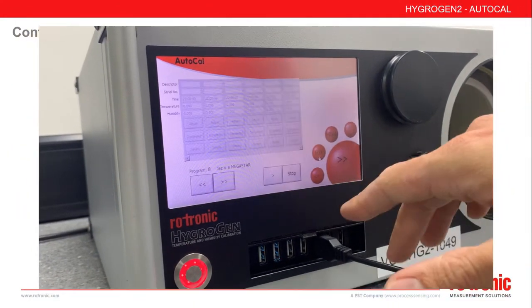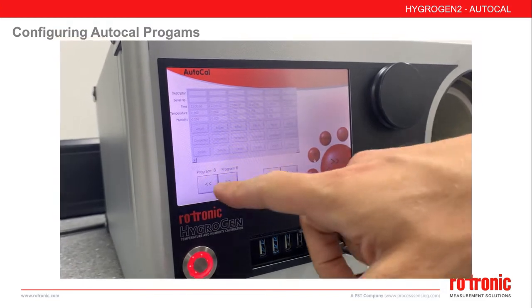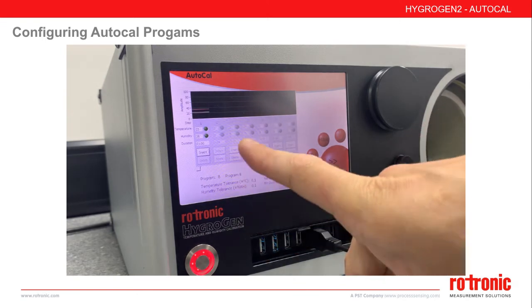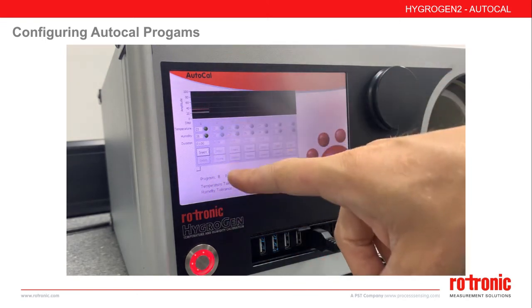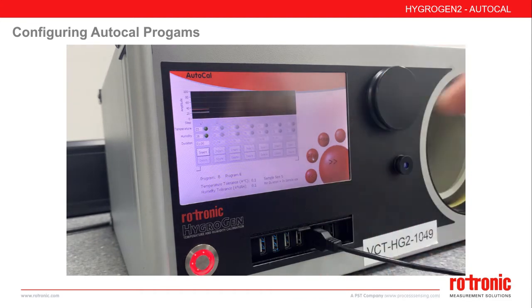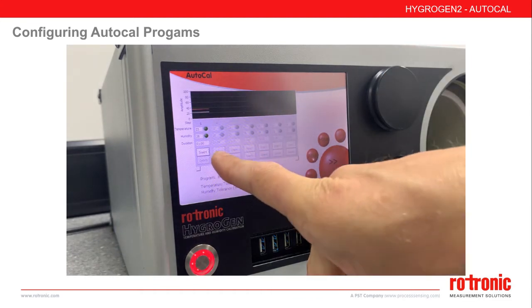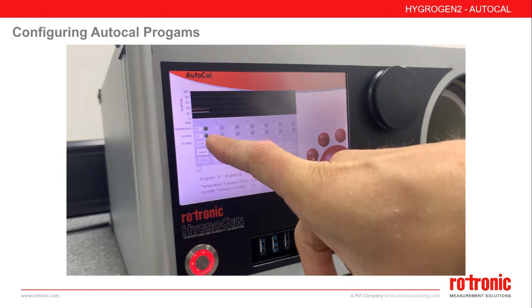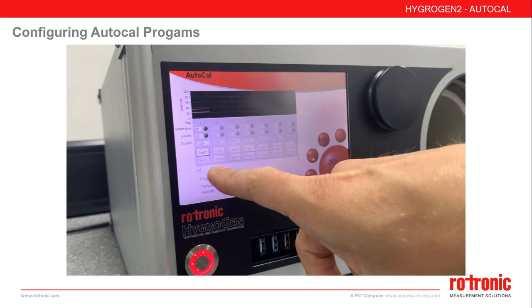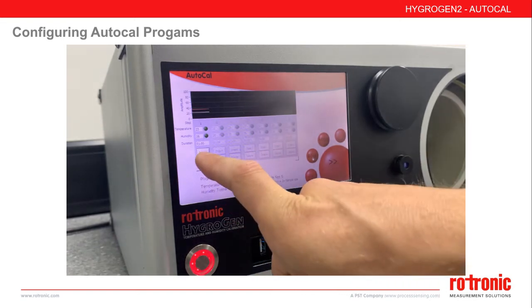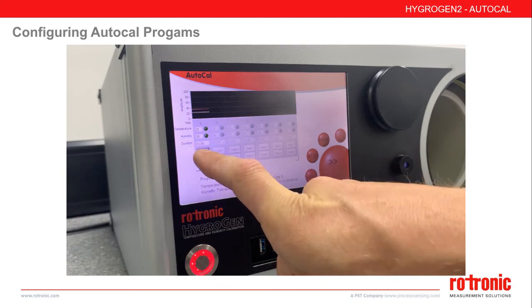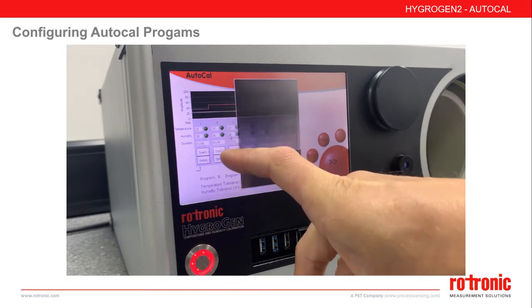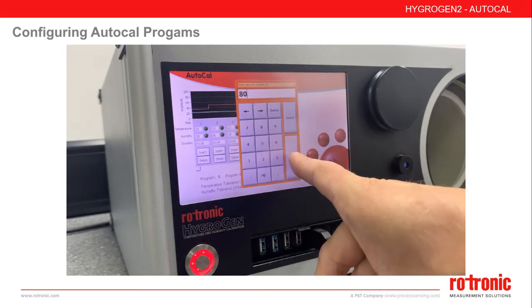To configure an AutoCal program, enter the AutoCal screen, select the required program, and choose Edit. Here you will see a similar screen to the standard programmer — each column represents a set point. For each set point, you have a specific temperature, humidity, and duration. You can insert as many columns as required. For example, we may do a 35%, 50%, and 80% humidity calibration at one fixed temperature.